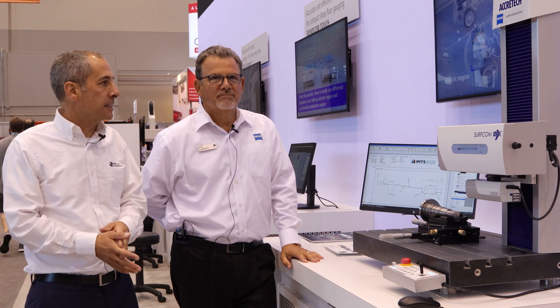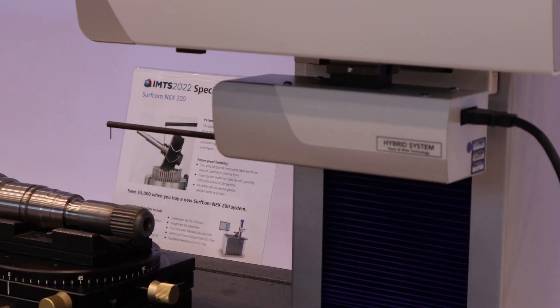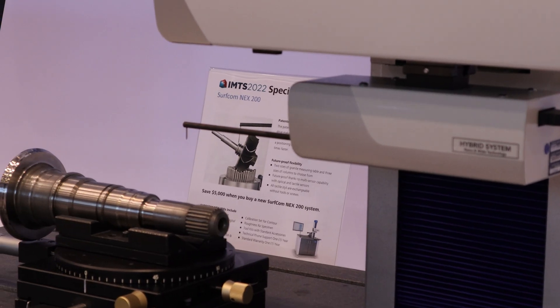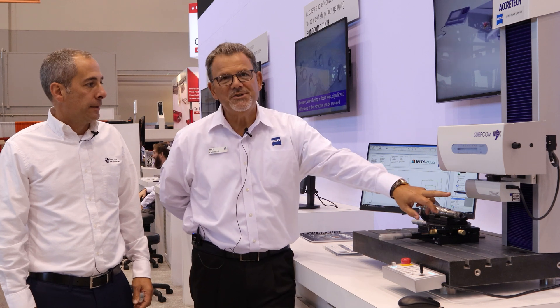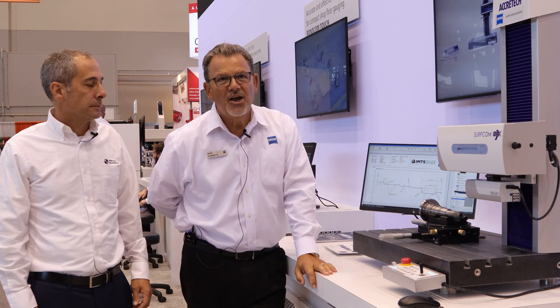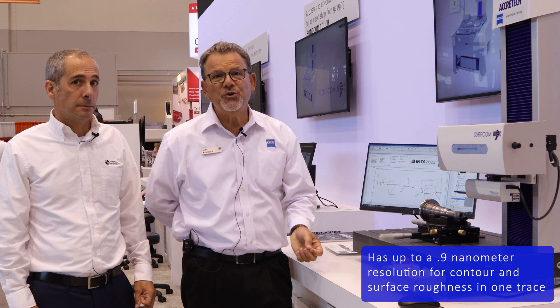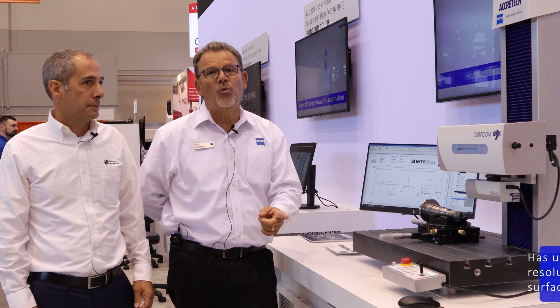There is a new Surfcom NEX. It's a hybrid. This is the Surfcom NEX 200 — our next generation hybrid. We're using the hybrid scale-based system now, which has a new specification at 0.9 nanometer resolution to do contour and surface roughness all in one trace.